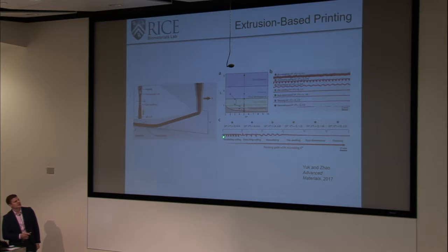But if you look at this single fiber that's produced here, for instance, just by changing either the velocity going across our substrate or the height from the nozzle, you can drastically affect the extruded fiber. So this is all the same material. This is one print. And you can see you get this coiling in the material. And if you are going too fast, if the nozzle is too high, you can get this pulsed fiber, so you lose structural integrity.